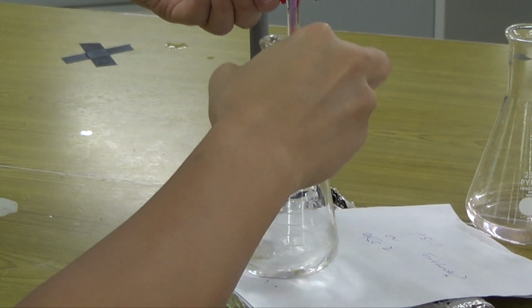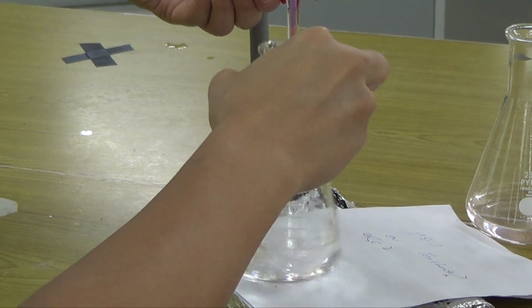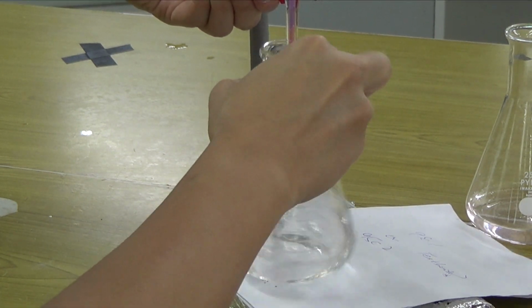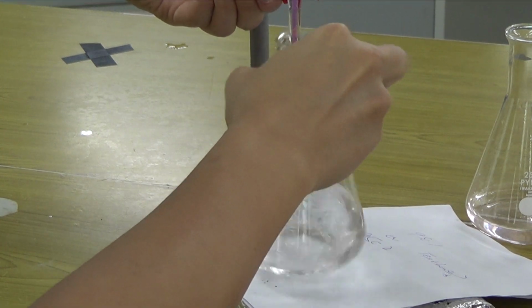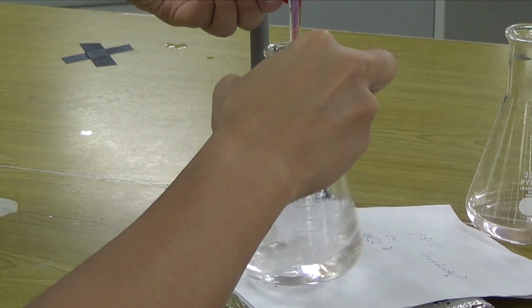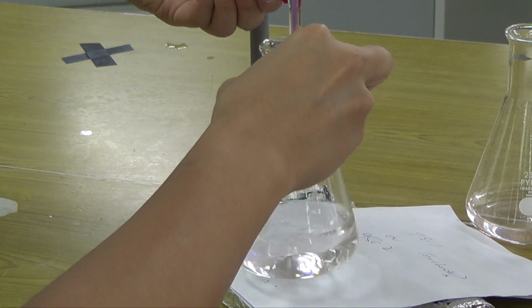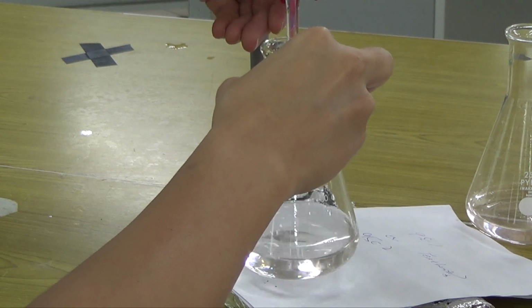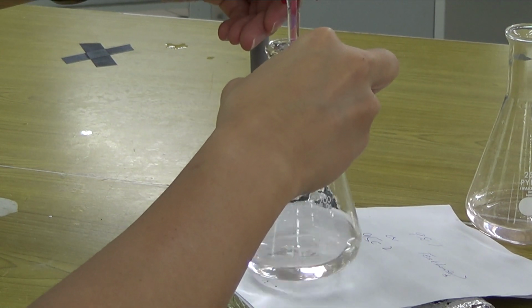I think it's getting there, really close. This is our exact titer. We don't want to waste time to do 1000 exact titrations. I think it's just about changing color with the next drop, maybe. It's very, very light, isn't it? Come on. Come on. Yeah. I don't want to reset.